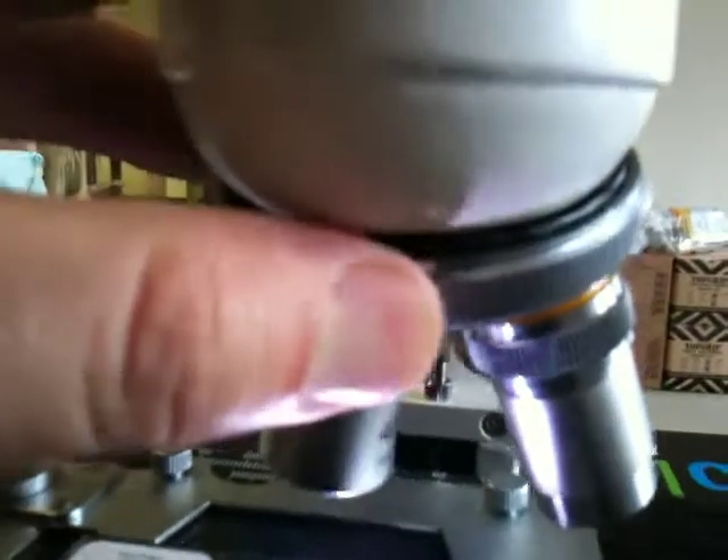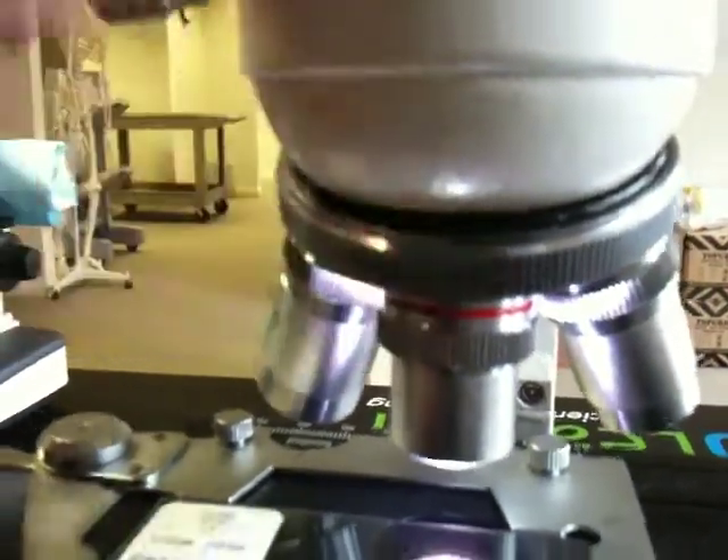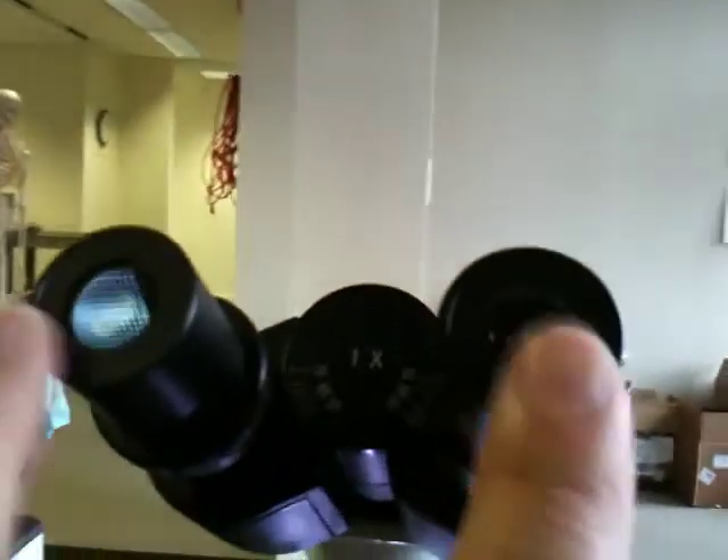So if it's not clicked in — let's see if you can hear it click. I hope you can hear that. But more than hearing it click, you can actually feel it click into place. If it's not clicked into place, then there is no light coming through, and you will see nothing but darkness through the eyepieces.